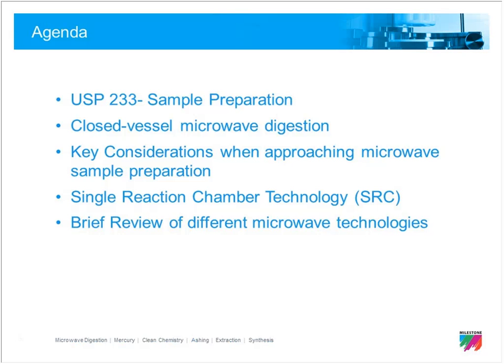So we're going to talk about 233. We're going to review microwave digestion and some of the key considerations as well when approaching microwave sample prep. We're going to talk about a relatively new technology in the area of microwave digestion called single reaction chamber technology, or SRC, and then do a real brief review on the different microwave technologies that are available from everyone out there.